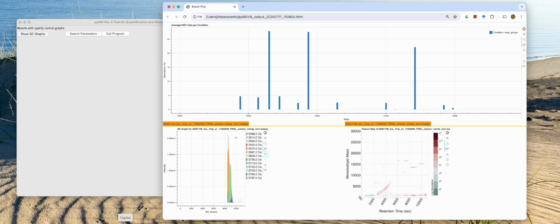If I reset this, you'll notice that there probably are some other unrelated proteins over here that just happened to meet the search criteria. If we were to quantify this, we would not want to add this information to our quantitation, because these are eluting way differently, are probably unrelated, and they're adding values that are summed up and represented here. So you'll want to go back and change the search criteria, which I'll explain in 10 seconds or so.